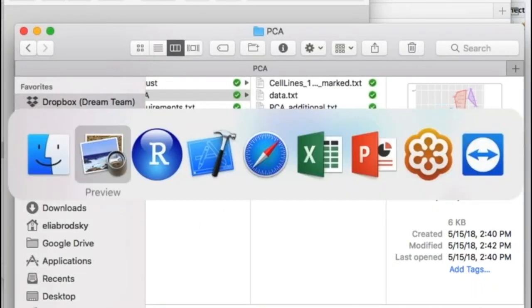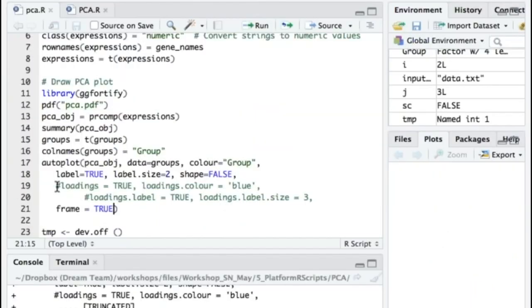Okay, and I have commented some other options which are perhaps hard to understand because some have mathematical meaning, but let us uncomment these strings and see what will happen. So are you following me and running that?